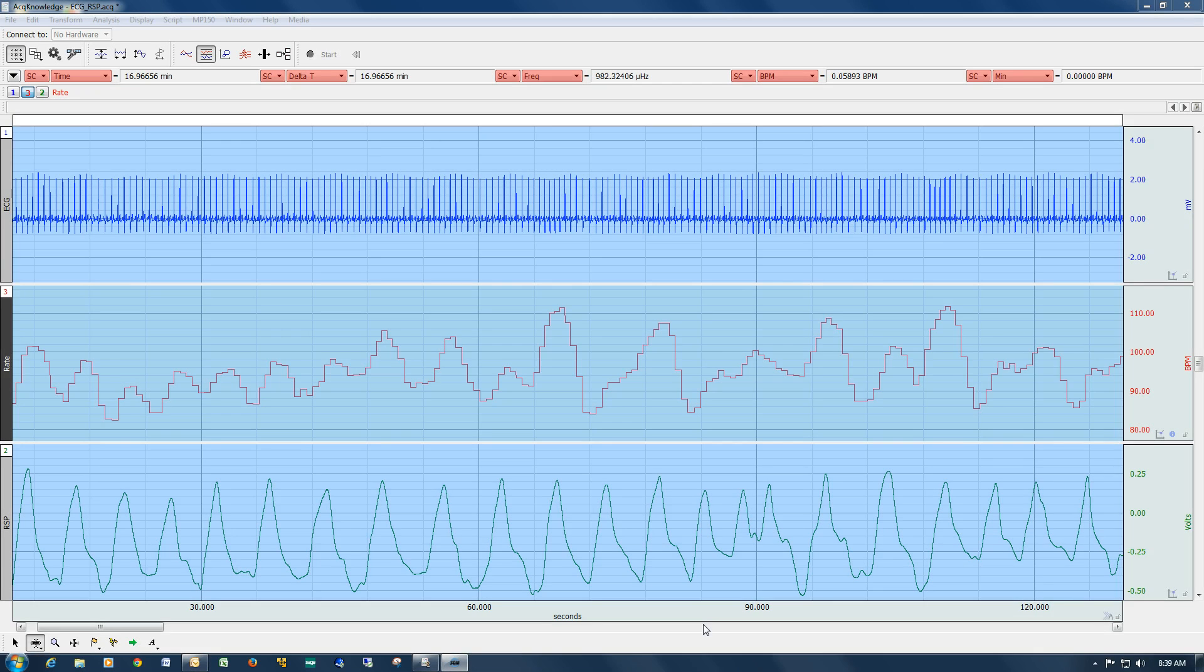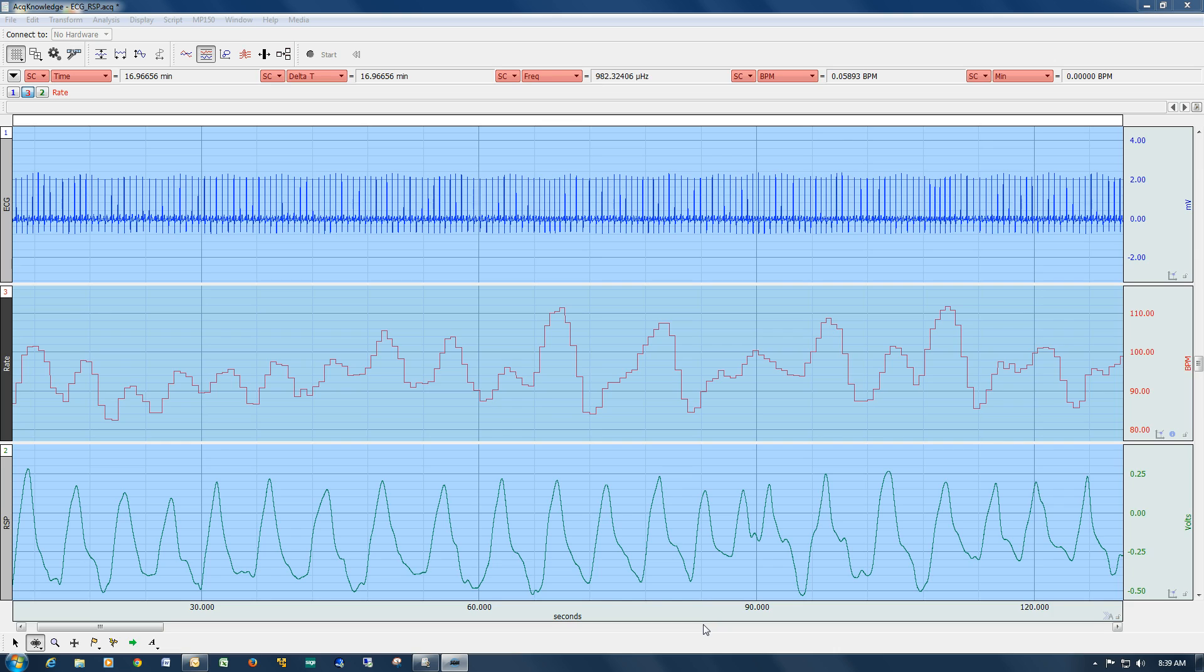In this screencast we're going to take a look at the AcqKnowledge smoothing functionality. AcqKnowledge will allow you to run a smoothing function either as an online calculation channel or as an offline transformation.